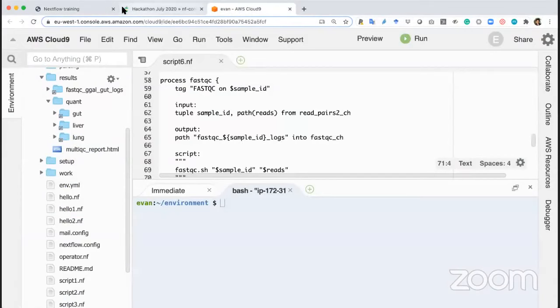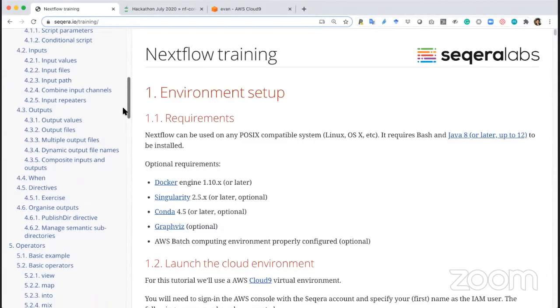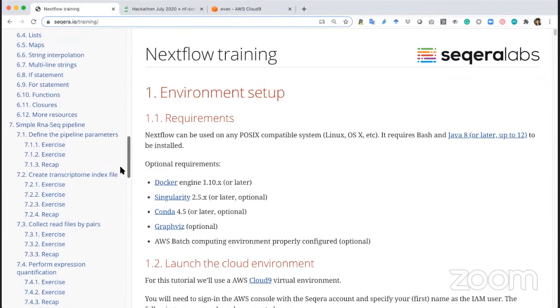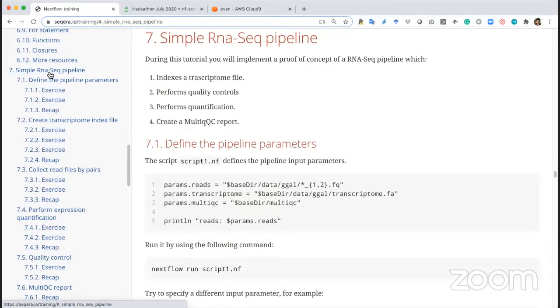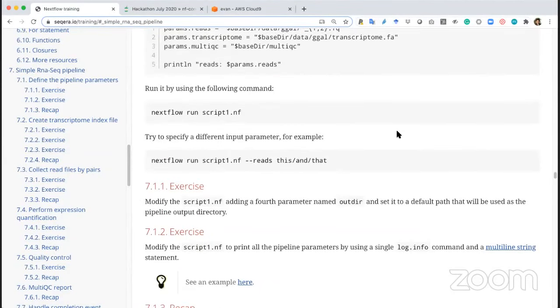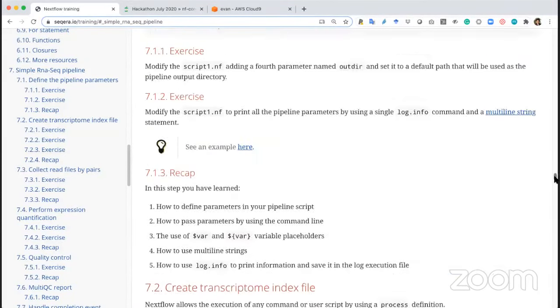Okay, starting today. We saw yesterday that we created this RNA-seq pipeline, which is the one that we typically use for training and also for demonstration purposes. We pulled together all of the syntax parts in this pipeline, adding the separate sections. We define parameters, channels and the various processes. And then the key part at the end was pulling that together with the use of operators.